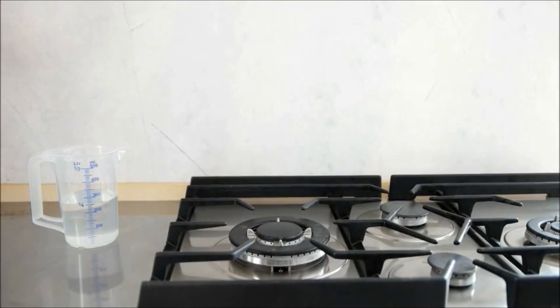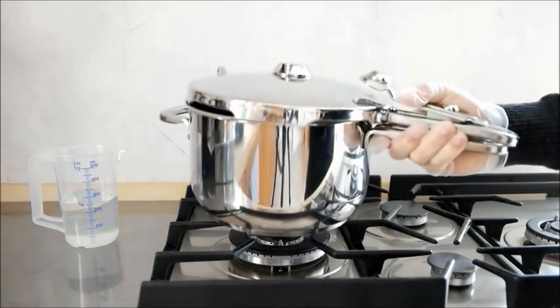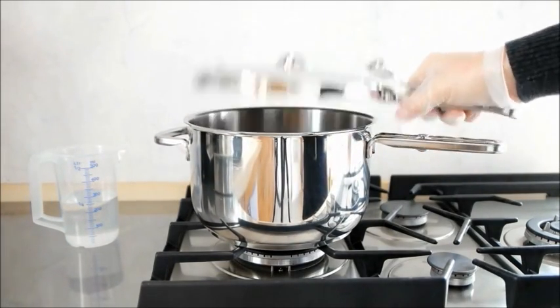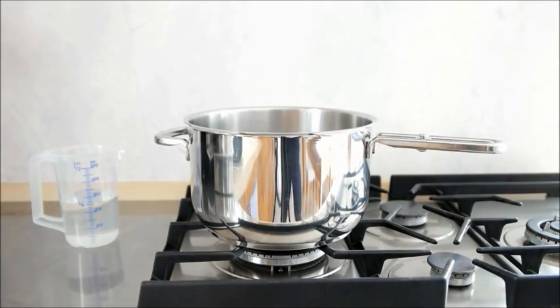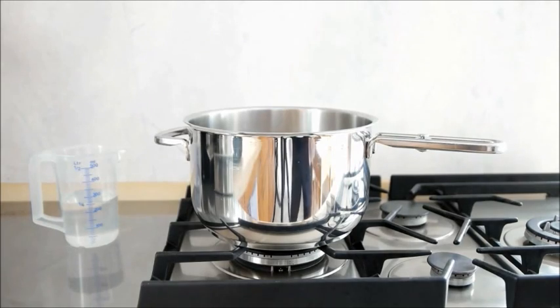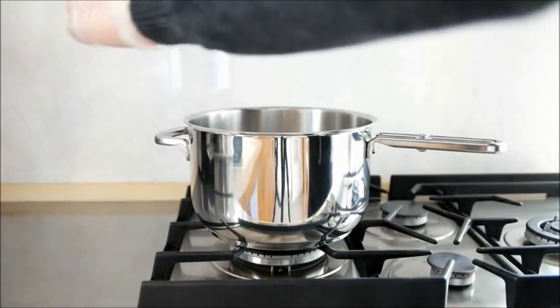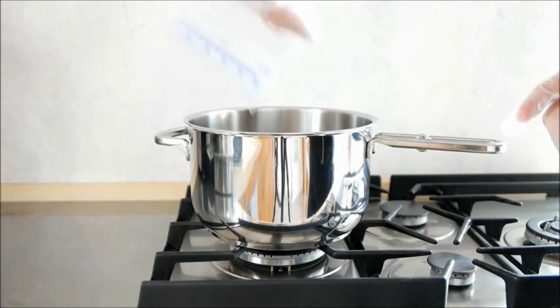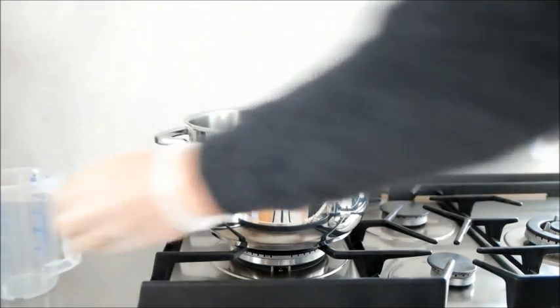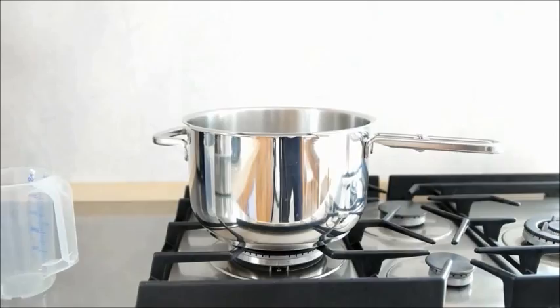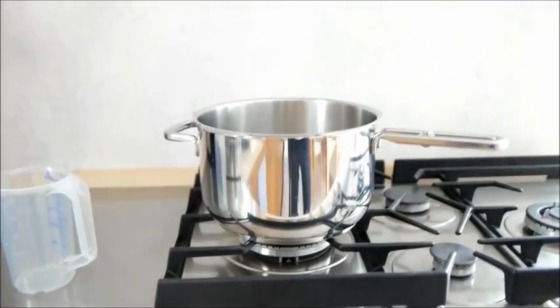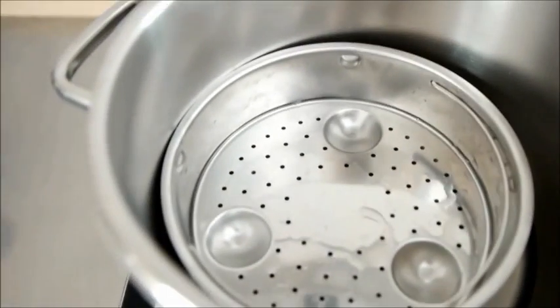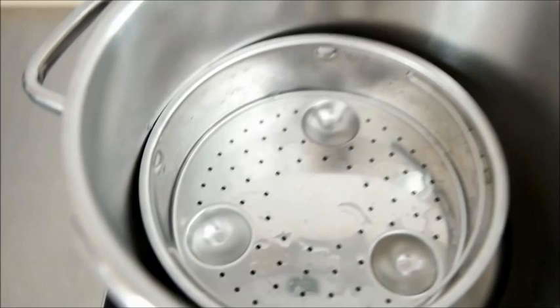Put your pressure cooker on the cooking plate and put in around one centimeter of water and use an insert where you can put your Erlenmeyer flask on.